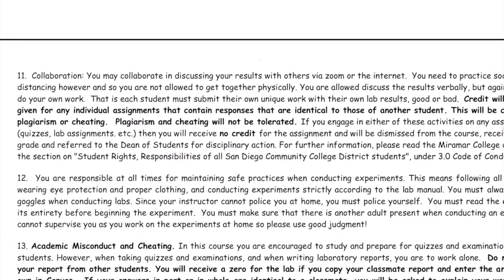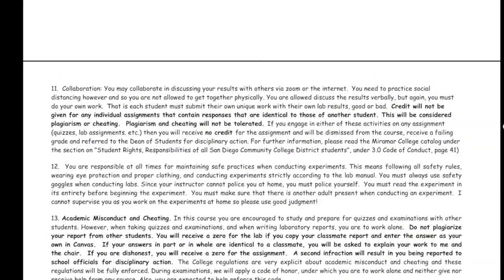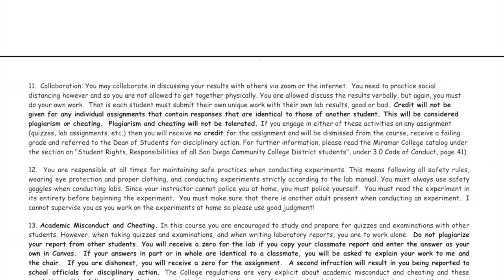The number one thing that we are always concerned about is your safety. So always be cautious when you are doing the experiment, especially since there are a couple of places where you actually have to light up your alcohol burner. You have to make sure you have a fire extinguisher nearby. An alcohol burner is no more dangerous than a match or a candle, but you never know, okay? Because you are going to be burning some ethanol, and if you have the ethanol container nearby, that could be problems. But knock on wood, I've never had an issue, and that's because we use a very small quantity, and we try to use chemicals that you can buy or find in your kitchen. So, read that.